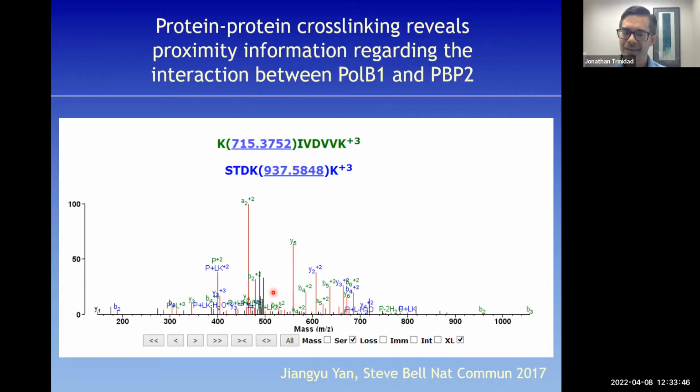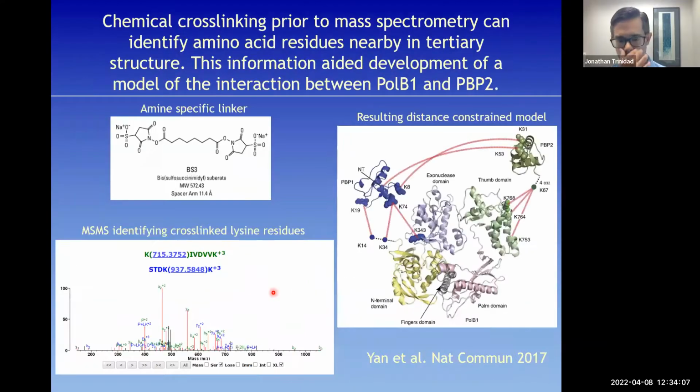While they're still stuck together, just the way that collision-induced dissociation works, it's going to be biased towards the weaker bonds, but I think it's also going to be biased to the bigger structure. And so we've gotten what I think is more evenly distributed fragmentation from these gas phase cleavable reagents.